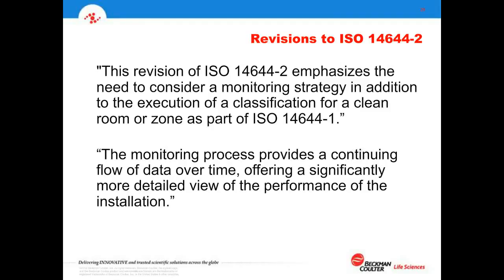So basically, this is focused on something a little different than classification. This is focused on giving us a continuing flow of data over time. Now, that might be a weekly or monthly basis. It might not be so frequent. It could be, though, second by second. But somehow it looks at this at an appropriate time interval, as opposed to classification, which is an event that happens once every 6 months or once a year, more commonly.